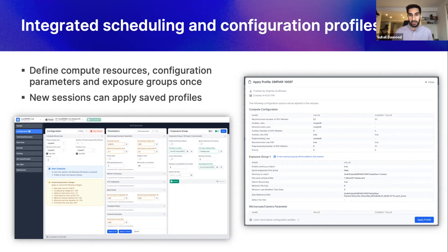The best way to truly understand how powerful CryoSpark Live can be is to see it in practice. My name is Stefan Arnold-Thawson and I'm one of the software engineers behind CryoSpark Live. For the next 10 minutes or so, I'll be walking you through a demo processing a real dataset. This isn't a live demo because we're limited by webinar time constraints, but check out the on-screen timer to get a sense of how long this 2800-movie dataset actually took. You can use CryoSpark Live to process movies as they're captured by a microscope during a data collection session, or process all your data in one go and obtain a first-cut reconstruction in a streamlined workflow.